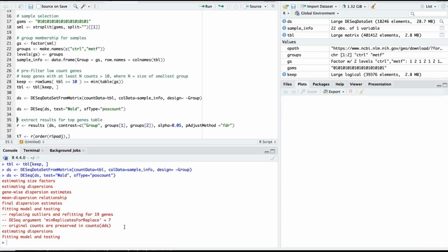You don't have to interfere, it all does by itself. So at the end you have a declared contrast, group 1 and 2. If there are more groups than 2, then you simply adjust this line or select this line.